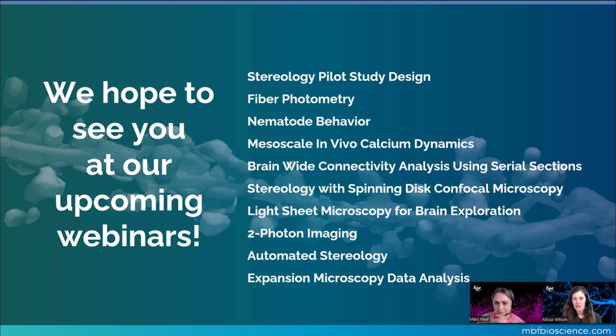And obviously, please contact us, and we can take a deeper dive into your image data and your PC and make any suggestions. But I guess the quick answer is there's no specific limit, but it is dependent on your computer and the complexity of your data. So the more markers that you have, the more objects that you have, the more image data, you're going to need the computer power to be able to visualize that. And I think we can definitely make specific recommendations too that will help guide you in that process.